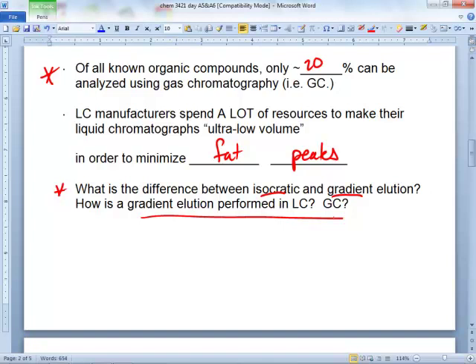To move these peaks around. Isn't it the same with temperature and so much? Well, the whole thing in a GC is located inside an oven, so definitely you have temperature. So you could mess with temperature. Can you mess with anything else?